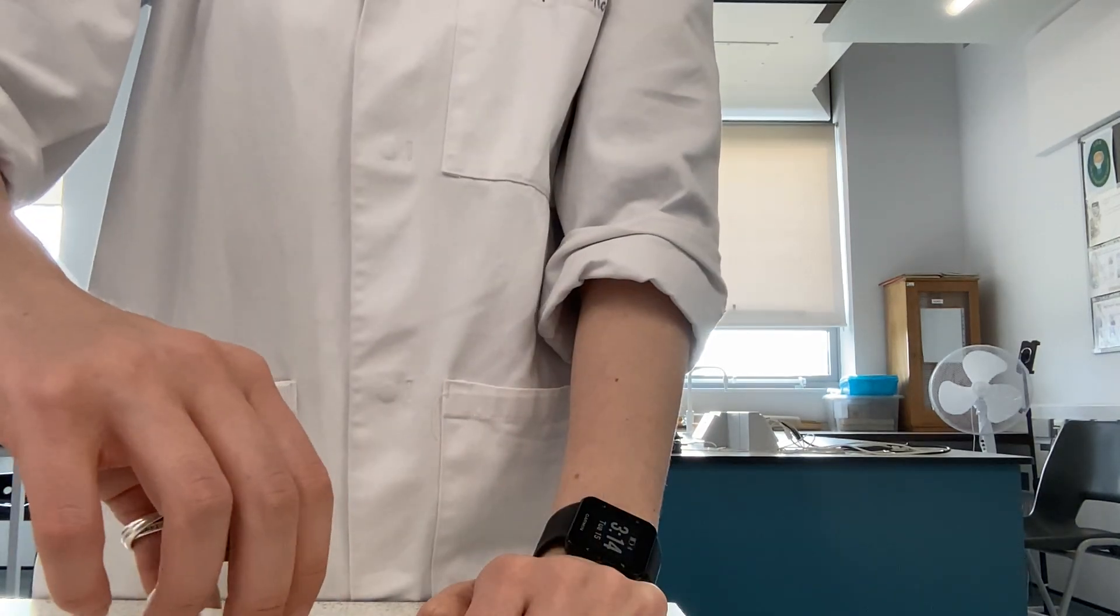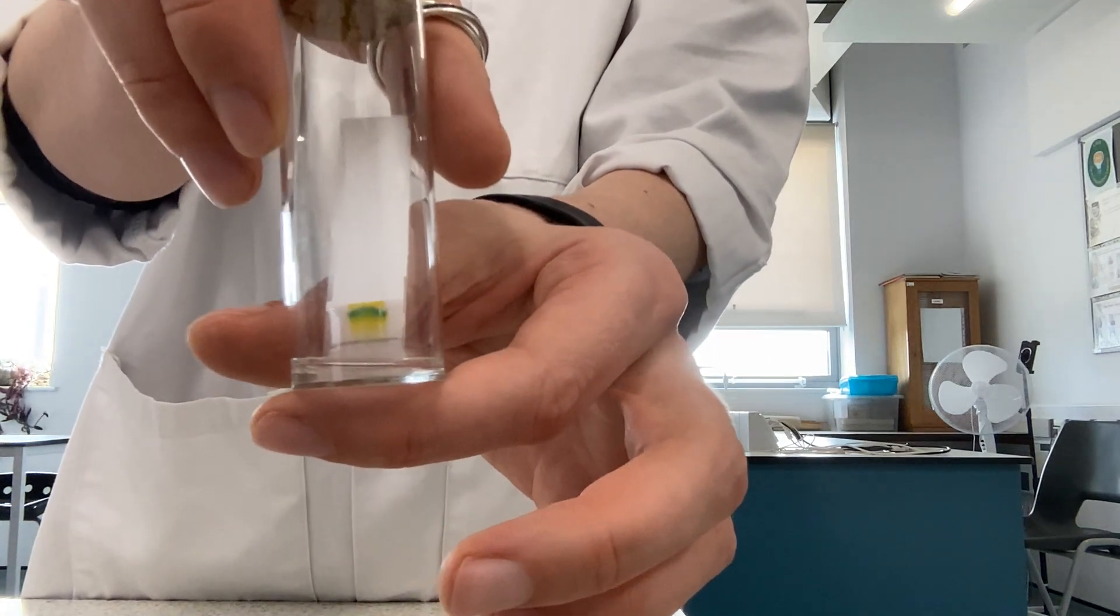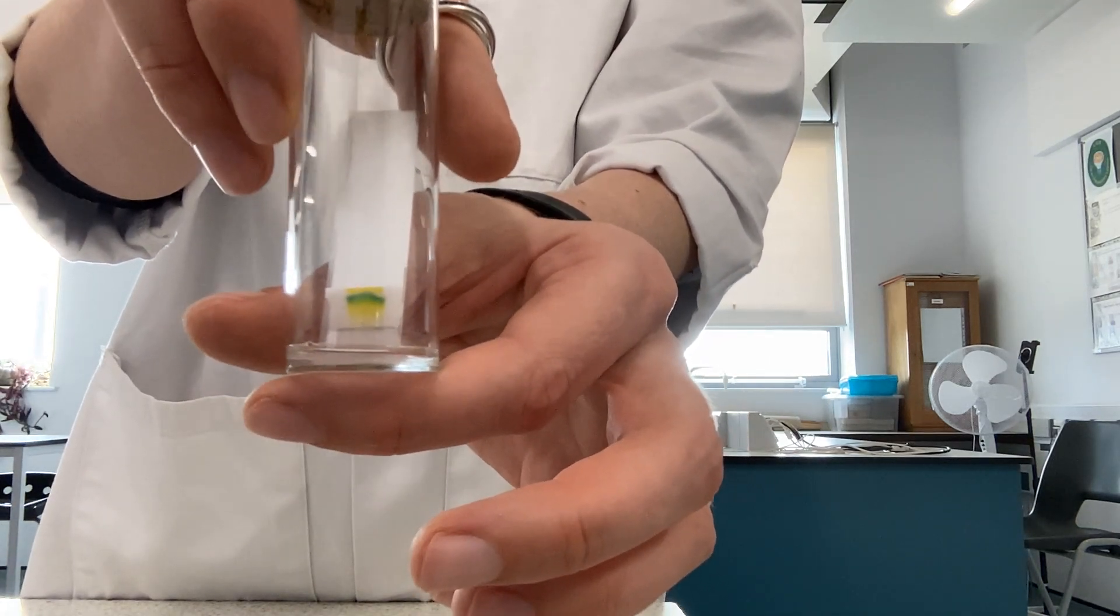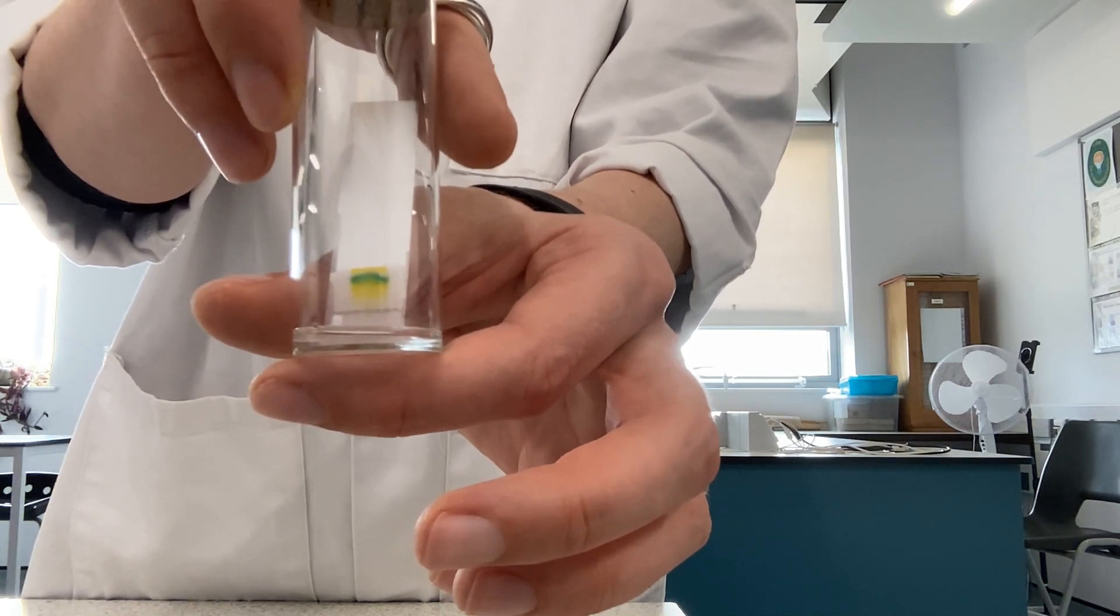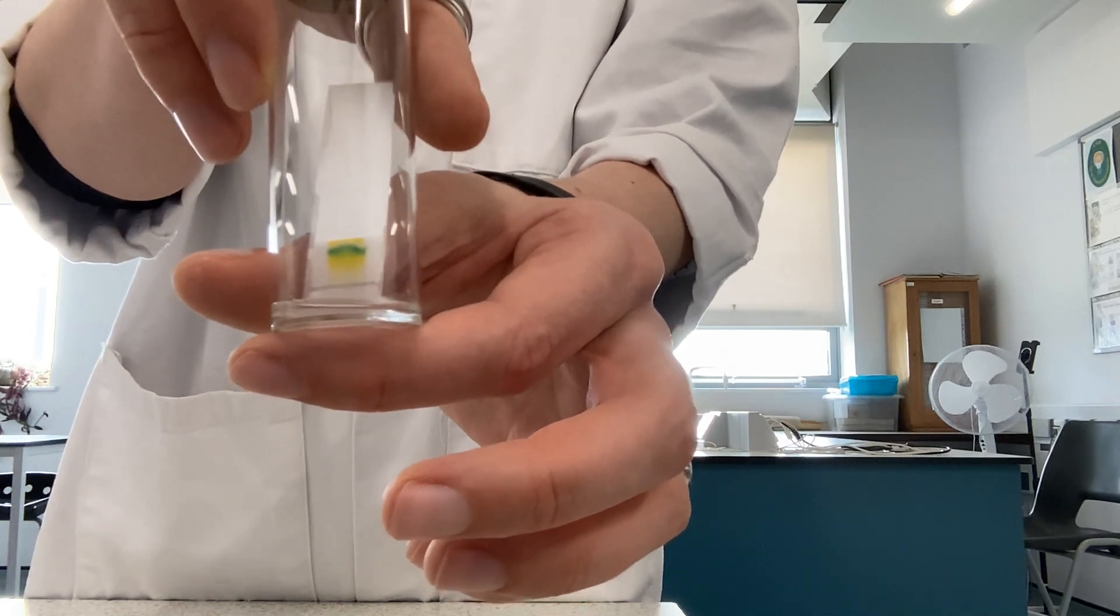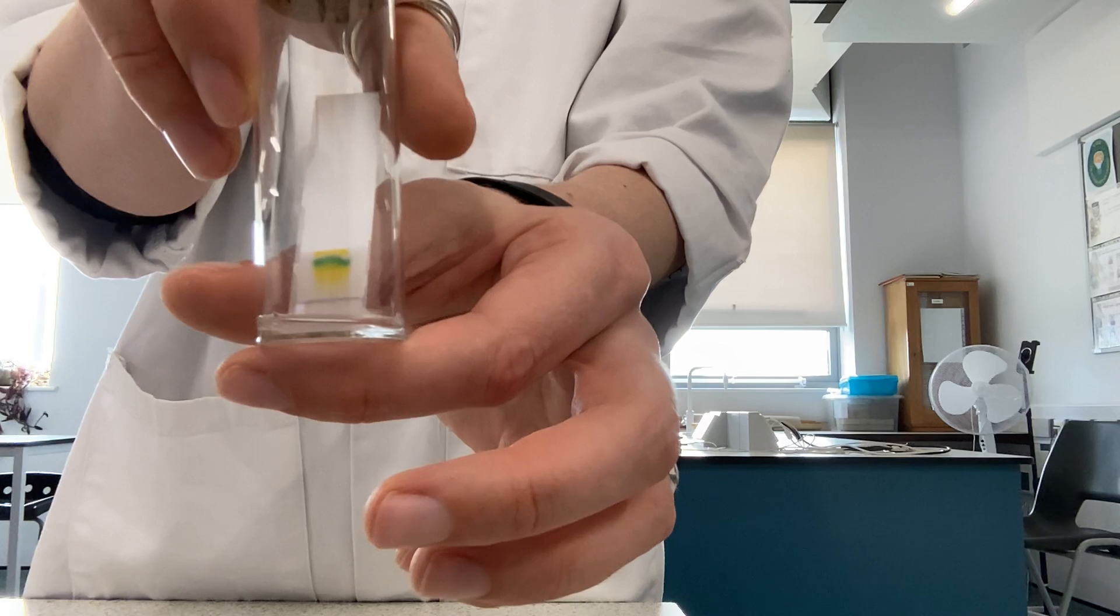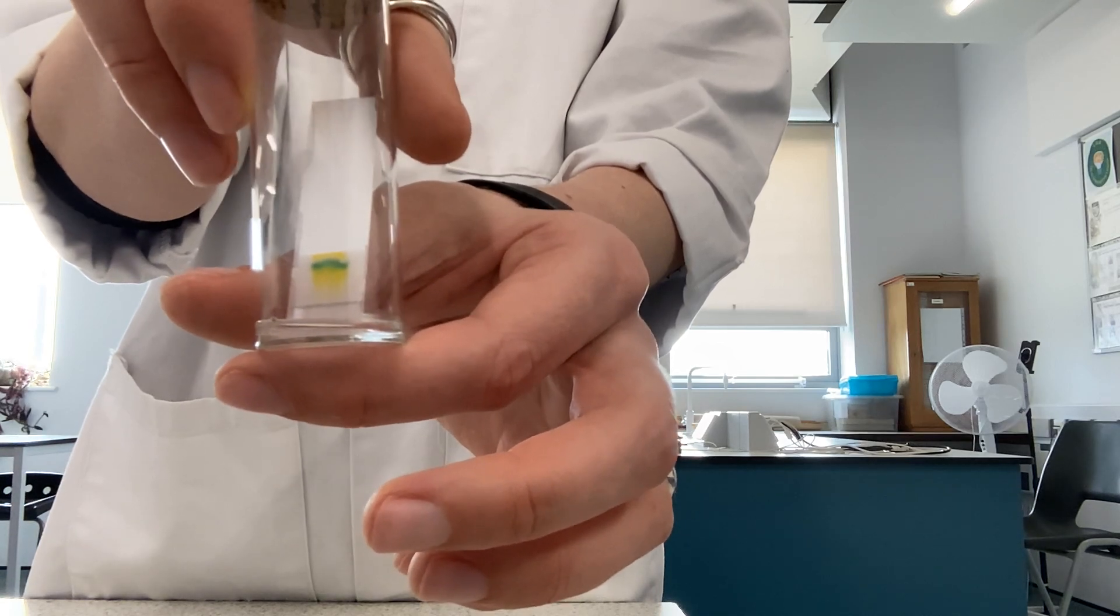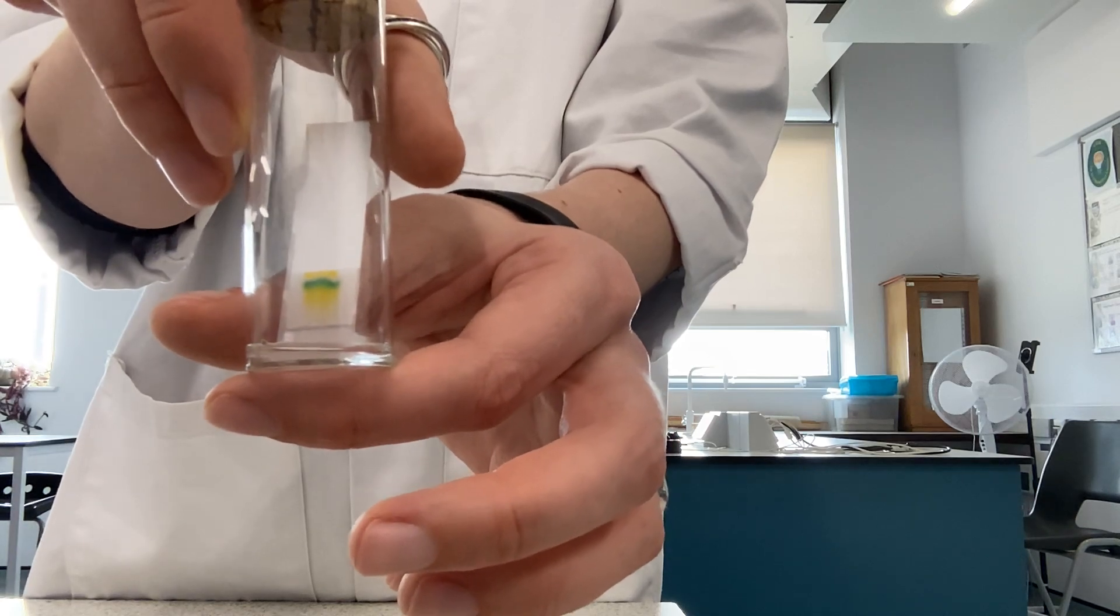Now it runs quite quickly, so if I hold this up to the camera we can see that it's already running up, and we can see a range of different colours that are starting to form as the different pigments separate out. What we'll do is leave this here until the solvent has reached nearly the top of the TLC plate, and then we will remove that and we can start to analyse the TLC that we have got.